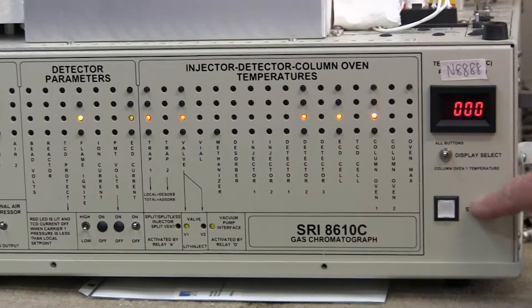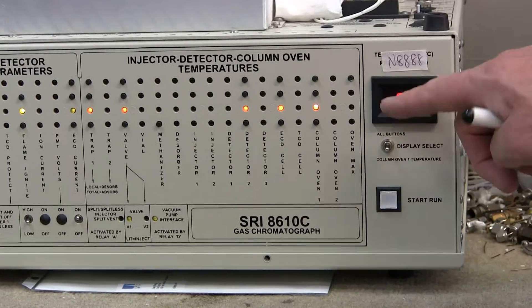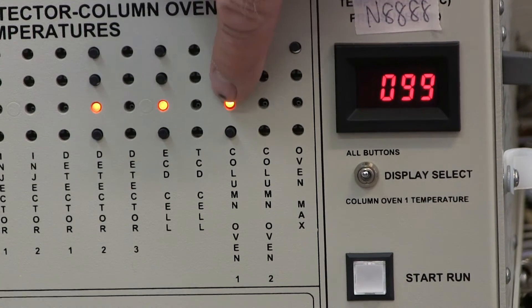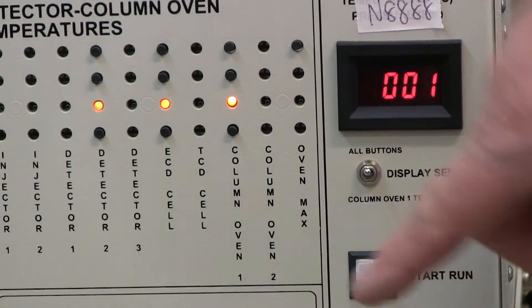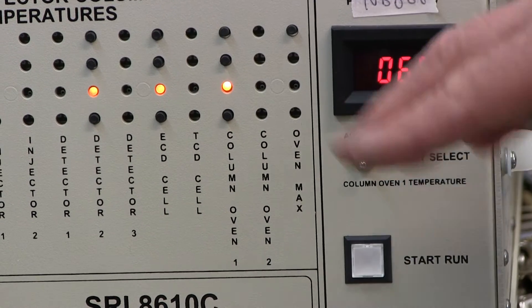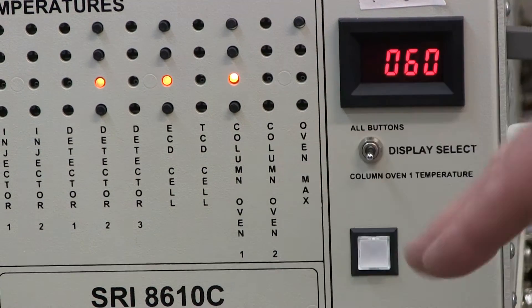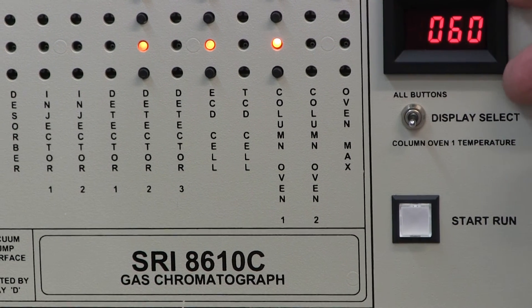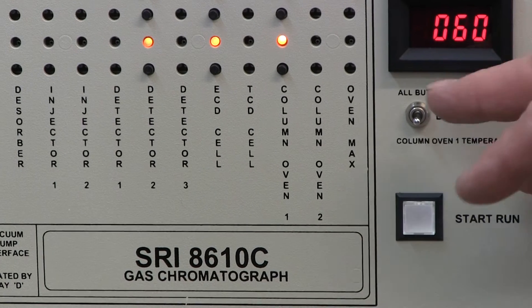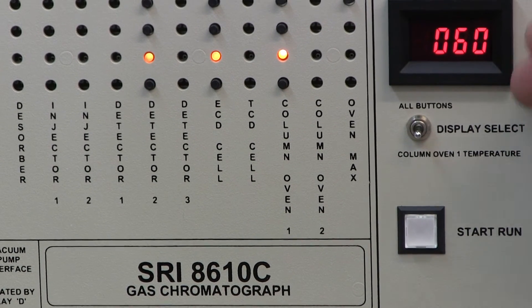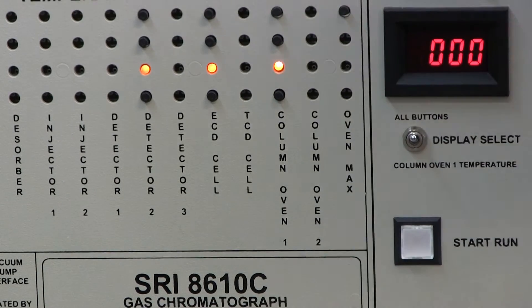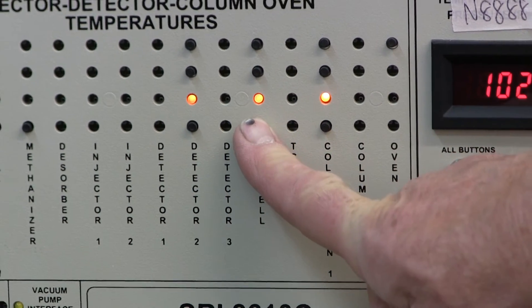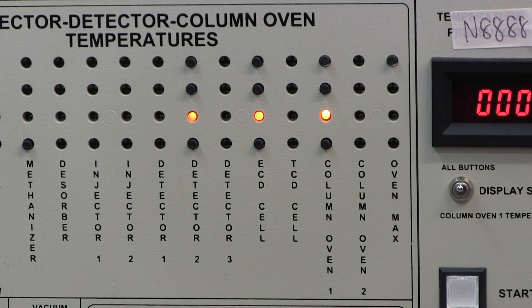Also there's a switch here below the display meter. When you flip the switch up, it allows you to read whatever button you depress. If you flip the switch down, it only reads constantly the column oven temperature. That's because most of the time, that's the thing that's changing during the analysis is the column oven temperature. But if you want to read, for instance, the ECD detector temperature, then you have to flip the switch up and then push the button that says ECD cell temperature.